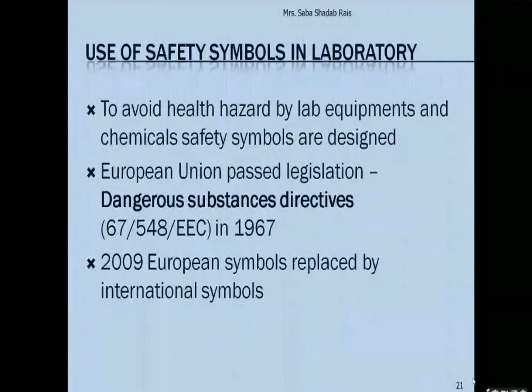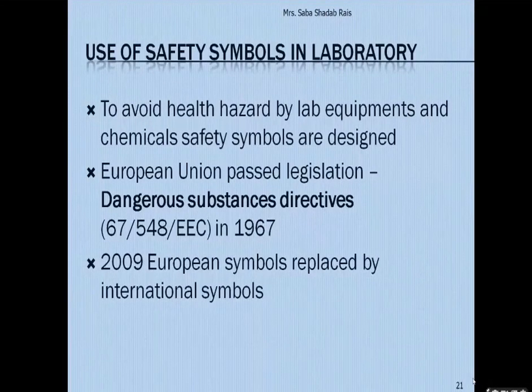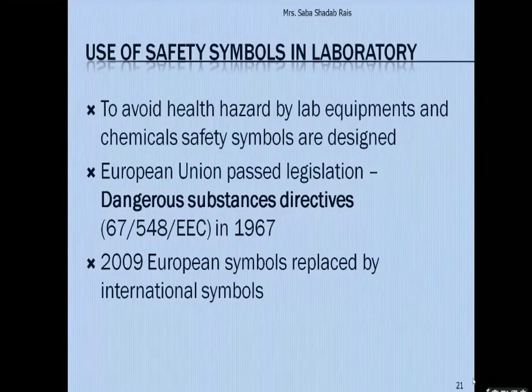because in this unit we are typically concerned with laboratory safety, right? So now we will understand the use of safety symbols in our laboratory. With the advancement of the biological sciences, new interdisciplinary approaches have come to understand the different principles in a better way. So the introduction of chemicals and instruments took place, which became very essential, and all these things came into the biological science laboratory.